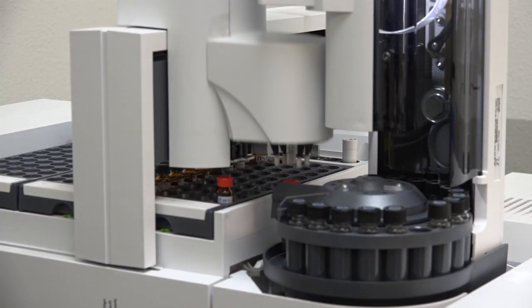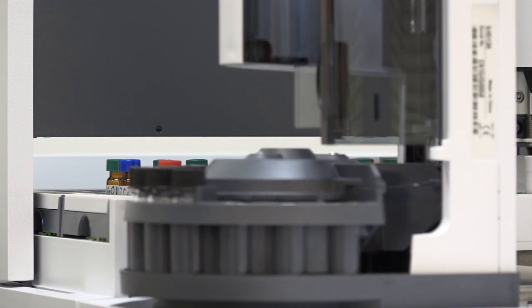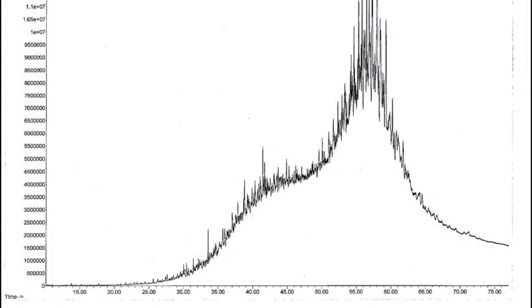You let the computer match up, but then you check if the computer picked the right compound. The images are generated from this machine that measures the chemicals in the oil and converts them into a graph or oil fingerprint. You see all these patterns, these weird looking spikes, which are individual compounds.